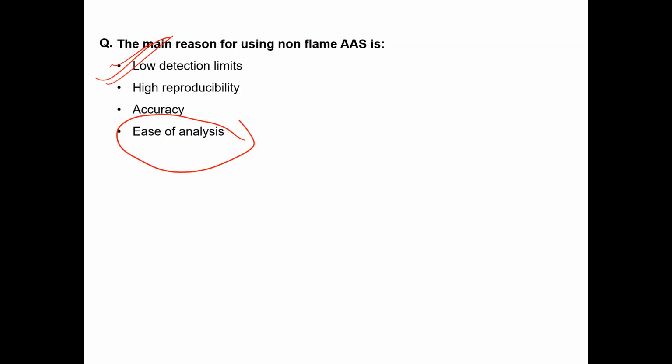Some instruments are designed in a way that they can offer a lower detection limit as compared to the existing version. In mass spectroscopy, every year there is a new development for improving the LOD. There can be many other objectives also, but that is a matter of a different discussion.